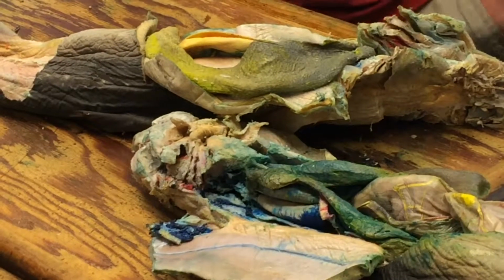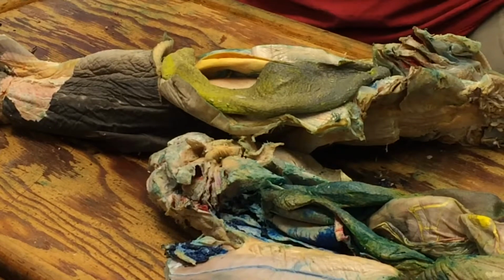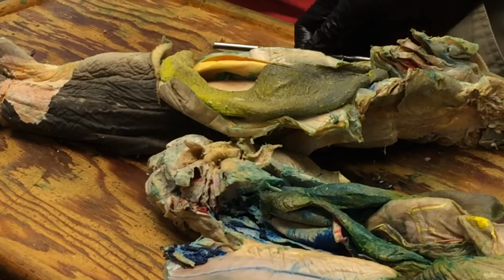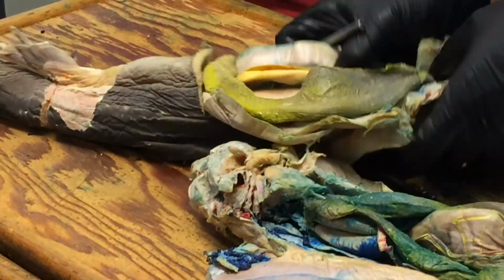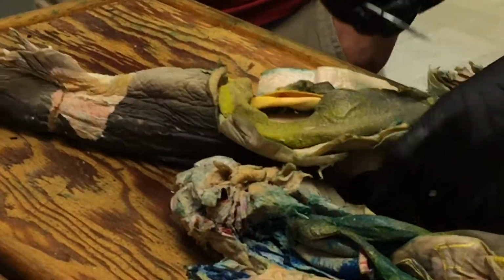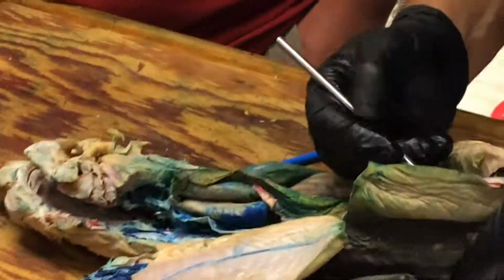Okay, accessory urinary duct. Did you find it? I tried my best. I don't think I did. And you guys didn't really get into it at all. I didn't think, yeah. You want to just tell me where to look? No, that's actually not my shark. Oh, oops, this is my shark. The shark switched. I have no idea where to find it. Okay, we can take a look.